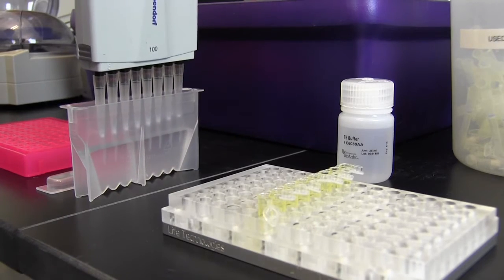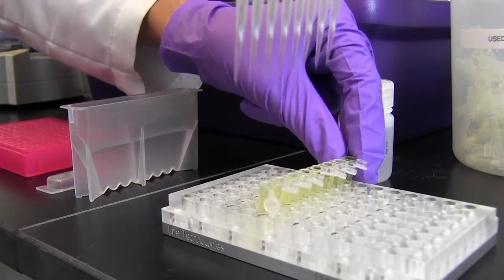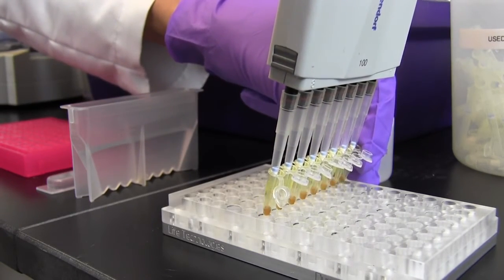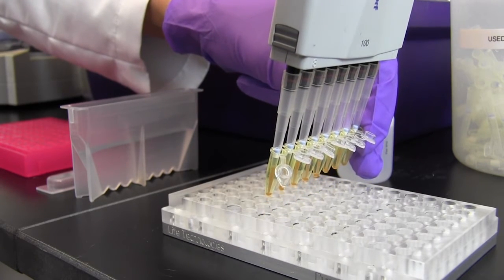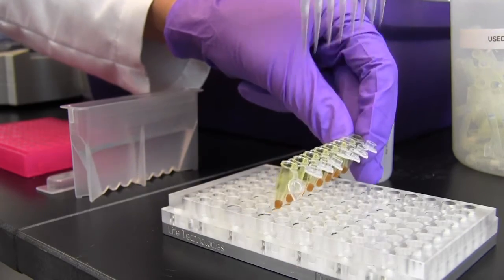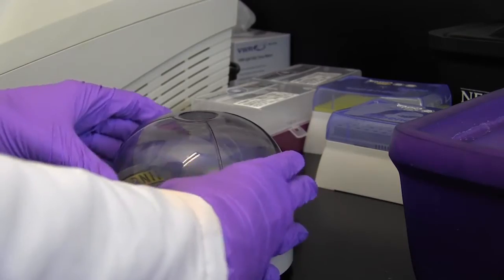Remove the tube or plate containing the dried bead pellet from the magnet and elute the library from the beads by adding 17 microliters of Tris hydrochloride or 0.1X TE buffer followed by mixing well by pipetting up and down or vortexing. A quick spin may be required to collect the liquid to the bottom of the tube or plate.